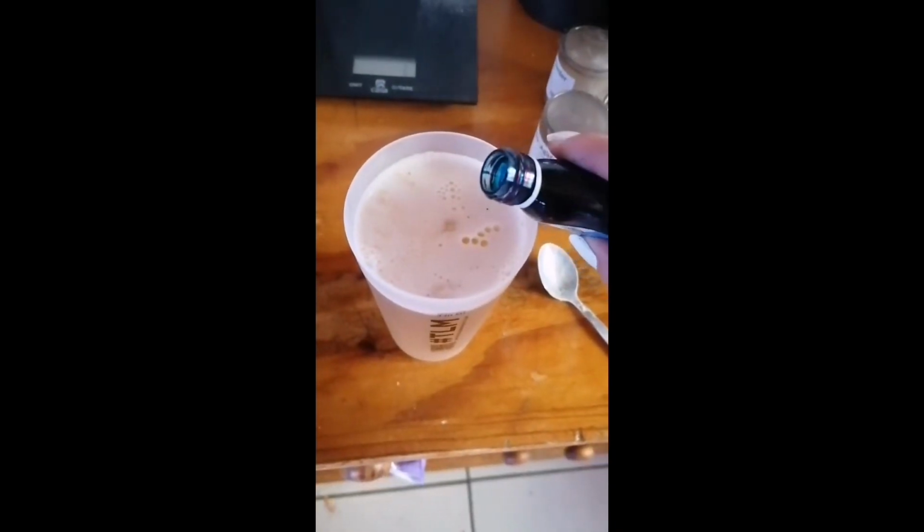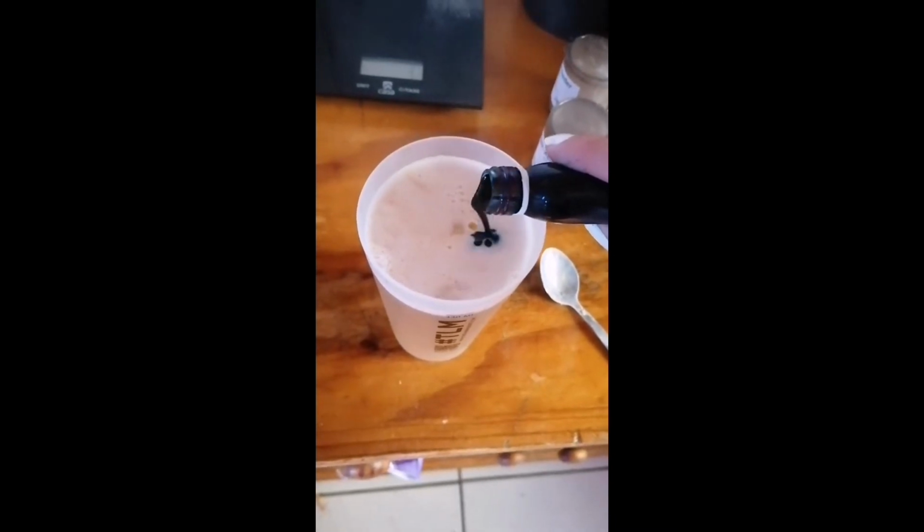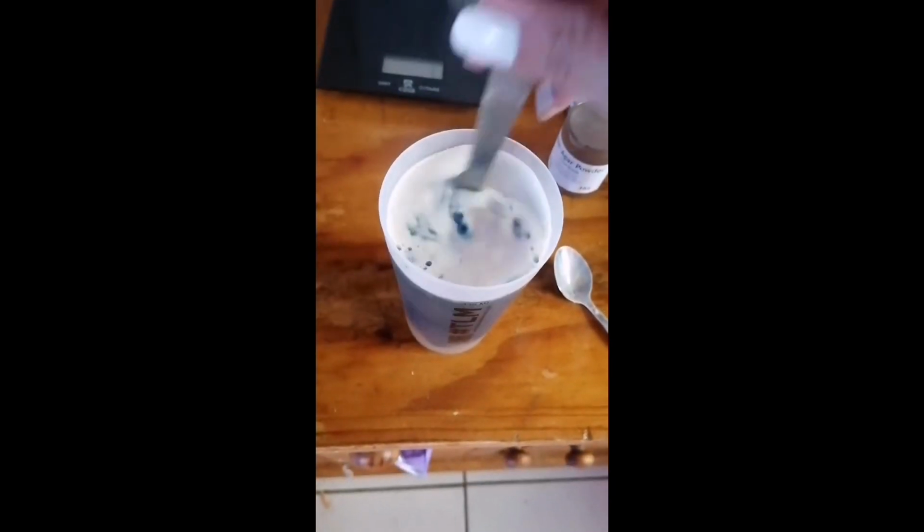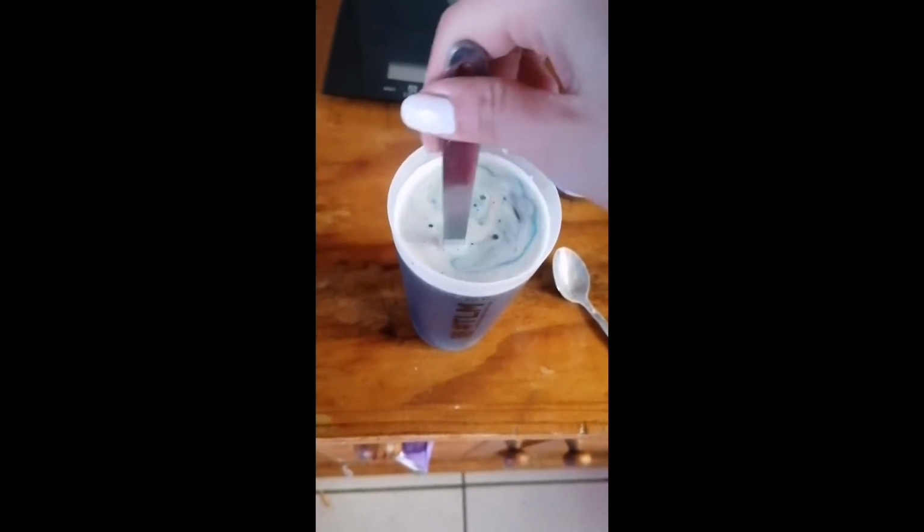Okay, next I'm adding some food coloring because I like colored agar. This is completely optional and you do not have to color your agar. It's just a nice contrast. Okay, mix it up. Now I will pour it into my bottle.